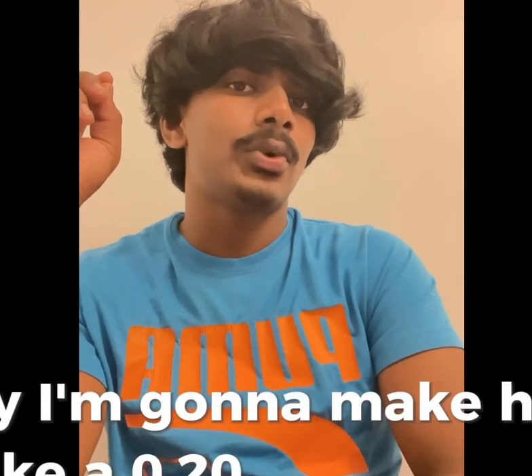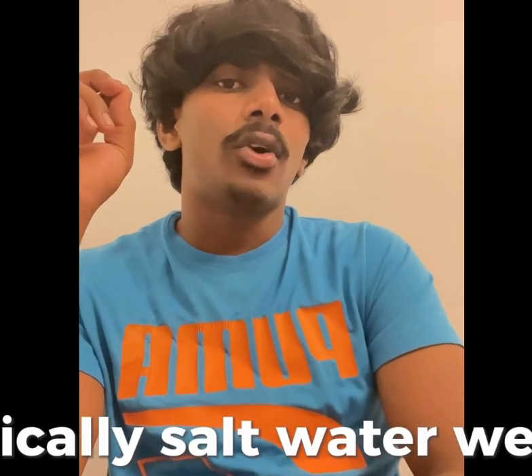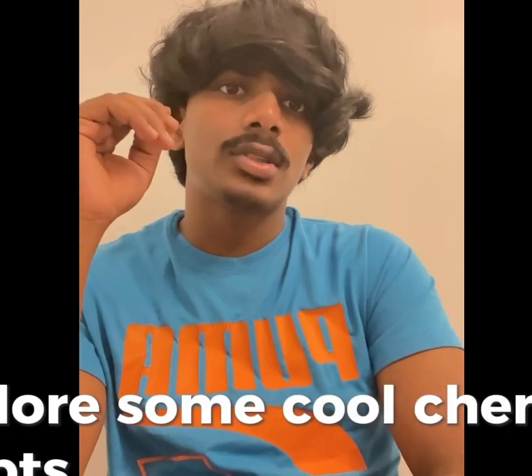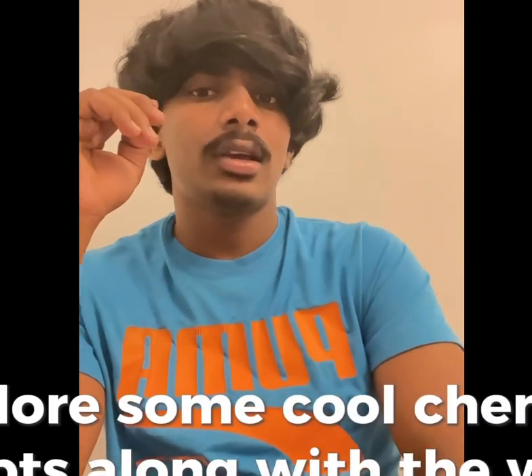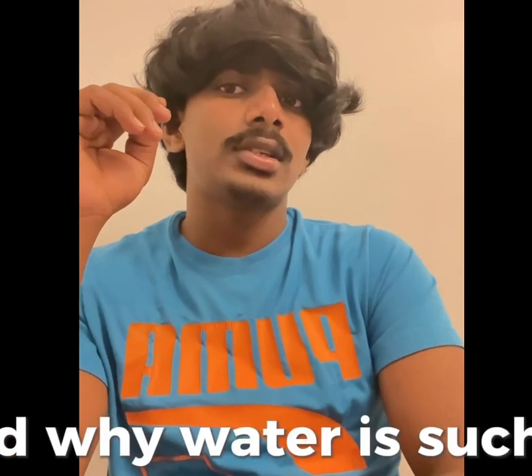Hey everyone, today I'm going to show how to make a 0.20 molar sodium chloride solution, basically salt water. We will prepare 500 milliliters of water and explore some cool chemical concepts along the way, like molarity, the difference between concentrated and dilute solutions, and why water is such an amazing compound.